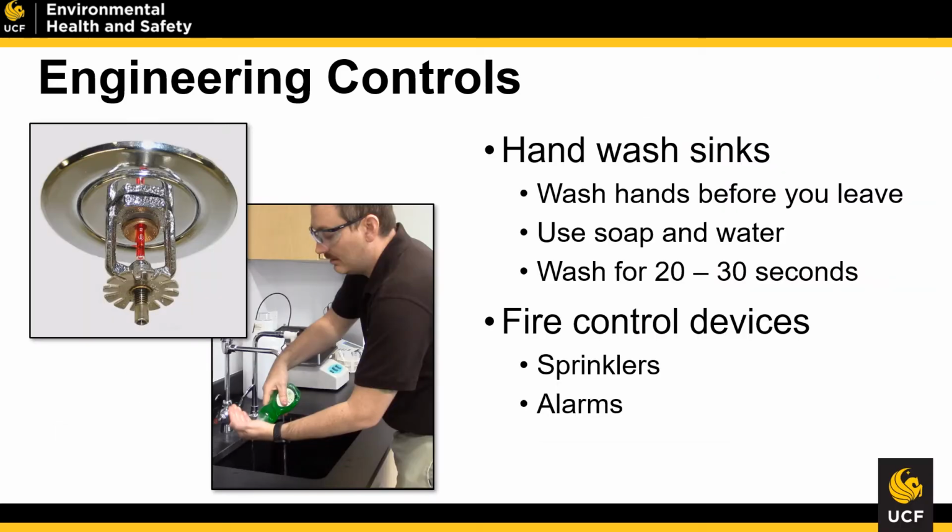Within a laboratory, you'll also find a hand washing sink. This sink is one of the best engineering controls for making sure that you have removed any type of infectious material from your hands before leaving the space. It's also UCF policy that you wash your hands before exiting the space. I encourage you to follow the CDC guidelines for washing your hands with soap and water for at least 20 seconds.